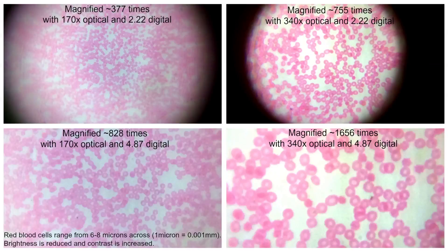And in combination with your phone's digital magnification, you can magnify something several hundred times over. Plus, with new lenses capable of 340x optical magnification, you can get a better picture than ever before.